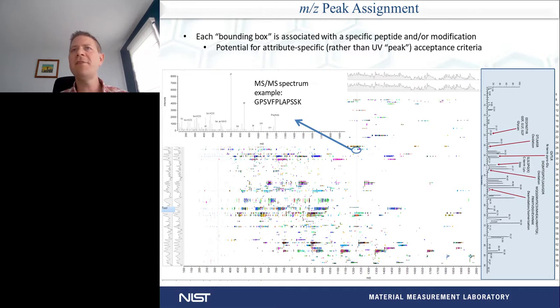So this is a little bit of a different representation of mass spectrometry. This is using some software that we've been utilizing in the past couple of years to look at analysis of these peptides. So on the right-hand side, you can actually see that we've sort of moved this chromatogram that we showed on the previous slide to be the y-axis.